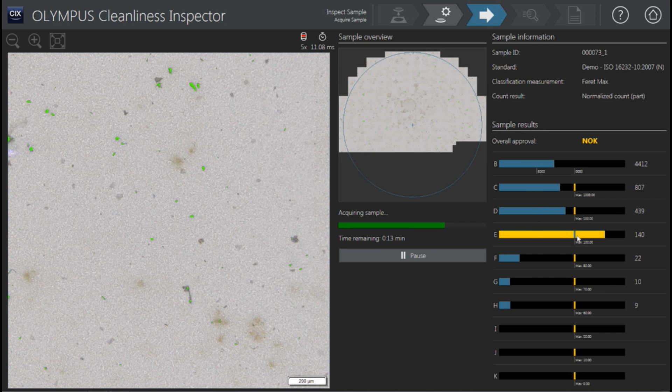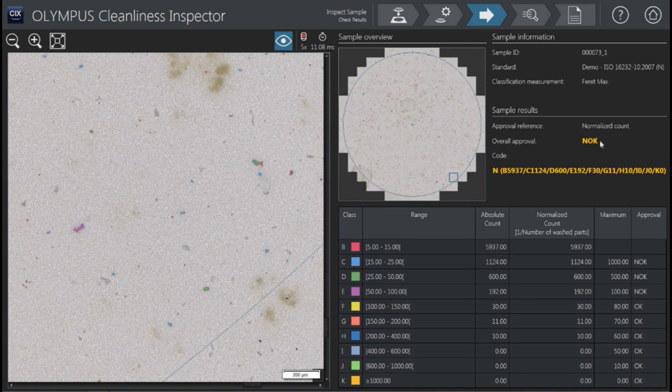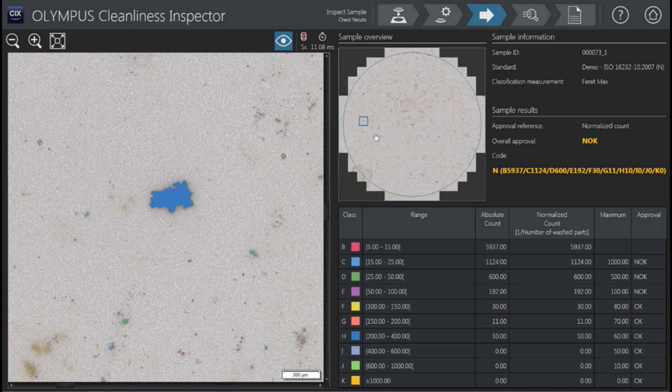Now two of the bins have turned yellow — that means we've gone over our maximum allowable amount of particles. Right away, the software is telling us in a live scan that this was not a good scan, which failed a couple of the bins. Once it's completed with the scan, that scan captured particles, reflecting particles, fibers, and reflecting fibers all in one scan. We can see our bins and our total counts. This allows us to move around quickly to get a view, and if something didn't look right, we could jump back to do a rescan.